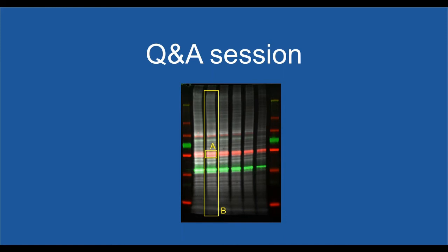Next question. For chemiluminescence Western, the membrane was kept for 2 months at room temperature, then proceeded to stain with Ponceau S. The total protein detection is very low. Some proteins could not be detected. So you wonder whether the proteins have been degraded. I do not think that you should keep the proteins or the blot at room temperature. I could not really pinpoint what factors are contributing to this. It might be the temperature, and it might be the Ponceau S as well.